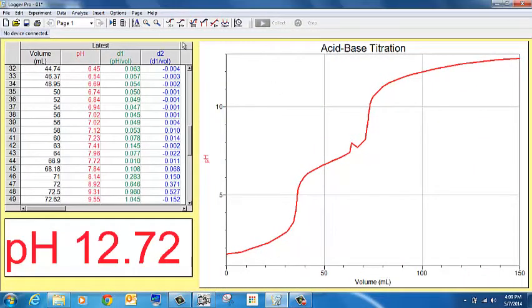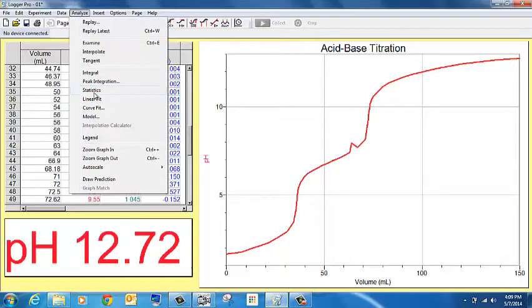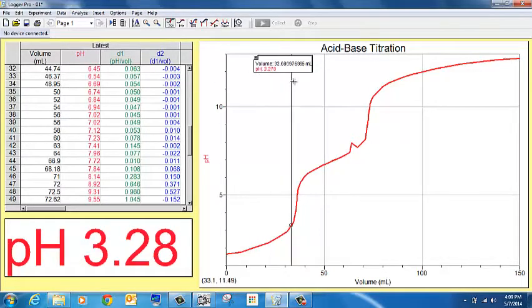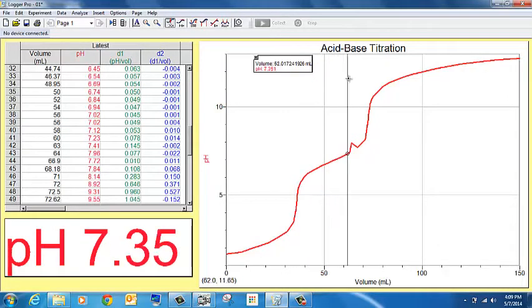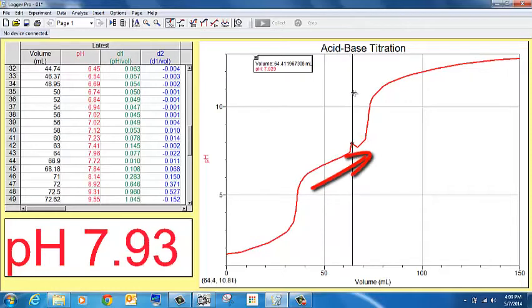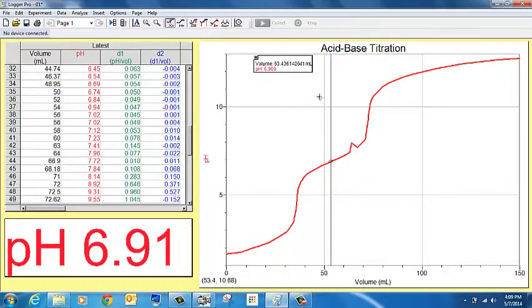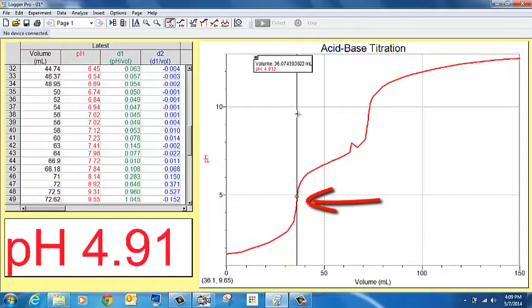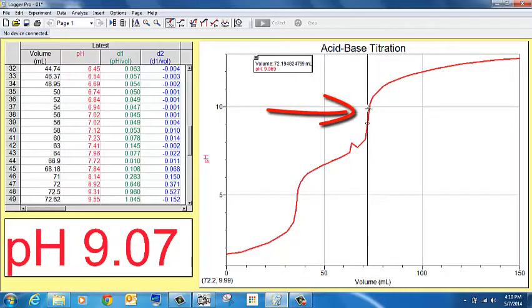So I'm going to use the interpolate function now to examine this graph. Analyze, interpolate. And you can see that this vertical line can be moved along the curve we have at any point and examine what's going on. I appear to have an outlier right there. So I've somehow had the pH rise up above where it seems to. It seems that there's a nice straight line curve or a nice smooth curve, anyway, from here to here. But there's a data point that's off a bit. That's okay. Those kind of things happen. That's called experimental error. What's really clear is that this cliff face right here is where one of the inflection points on the graph is located. And that means there must be an equivalence point right along there. And then there's another one somewhere along this cliff face.